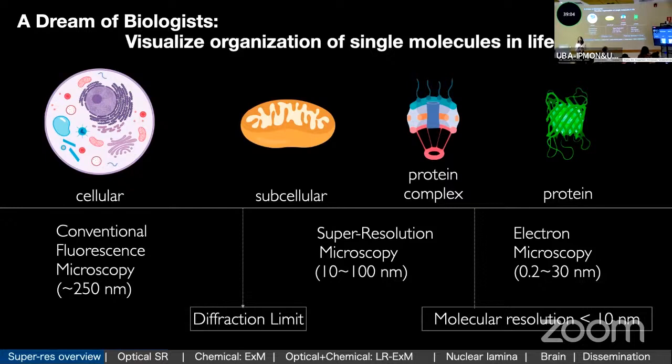At the cellular level, diffraction limited microscopy should have no problem helping you count the cells, tell which stage they are, and how they connect with the ECM. But if you wanted to take a closer look at the subcellular levels, like the organelles, microtubules, axons, dendrites, you will need super resolution, or even the electron microscopy field to have sub-nanometer resolution to really see the conformation of the proteins and how they bind onto the drugs.